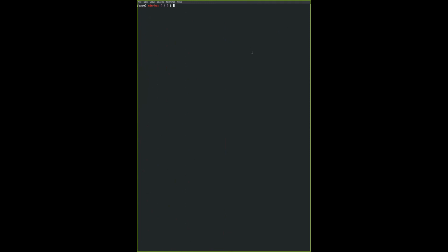You can also specify other directories, not only within your current working directory. For example, earlier on I told you about this sign, tilde. I'm not sure if you're able to locate tilde on your keyboard, but it's usually at the top left hand corner of the UK style keyboard. If you type this, it will list out the folders and files in your home folder, the folder that you open up the terminal from.